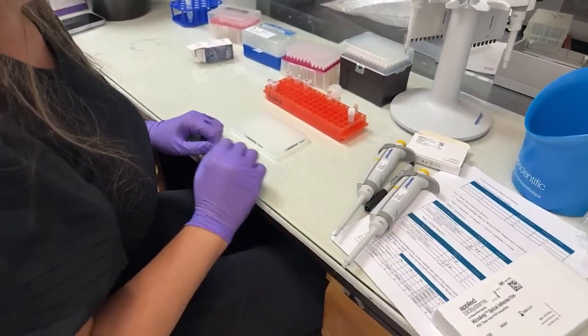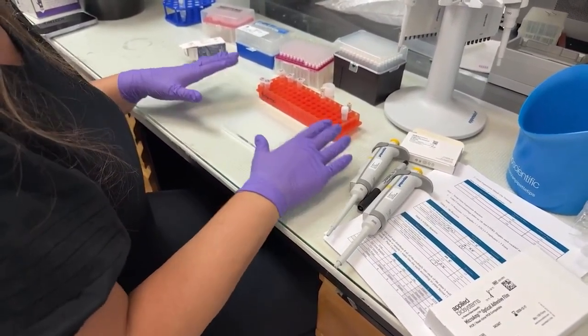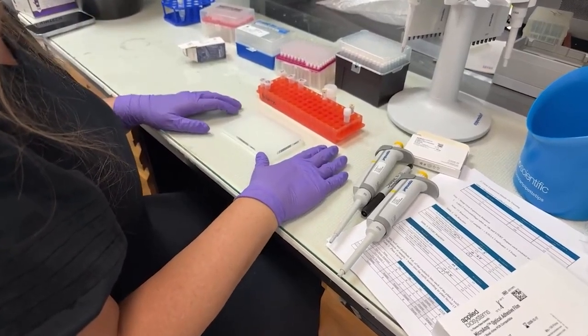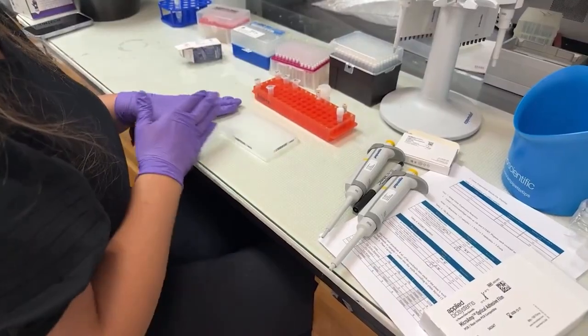So I've got a map and you'll see it in the follow-up and in my printed protocol, but what I'm going to do is put each of these master mixes on the plate.